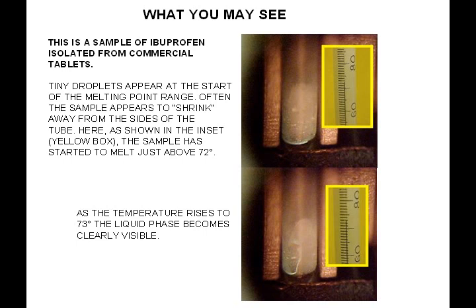Here's ibuprofen in a capillary tube. The ibuprofen's been extracted from a tablet, and we're going to look at the melting point to determine whether or not the sample is pure.